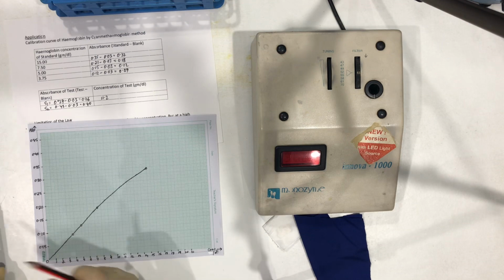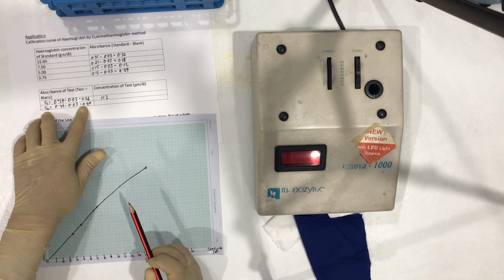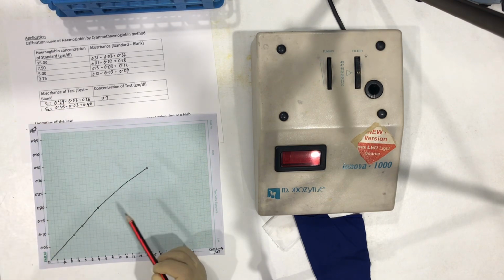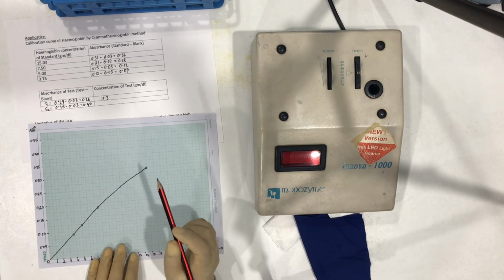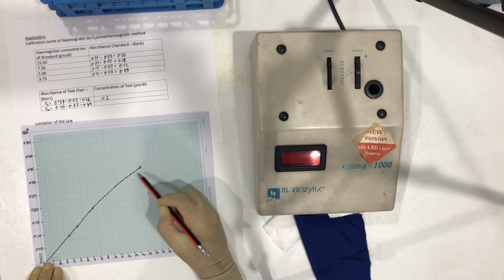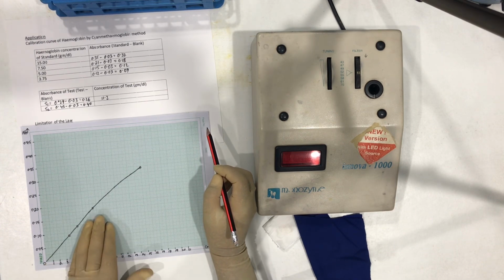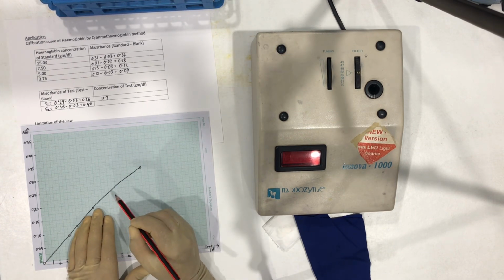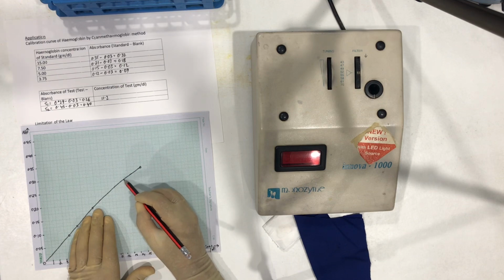Now let us see the concentration of S2, that is the absorbance is 0.40. Now this curve is not going to go straight forever. In fact, if you see it closely, it has started deviating from here.